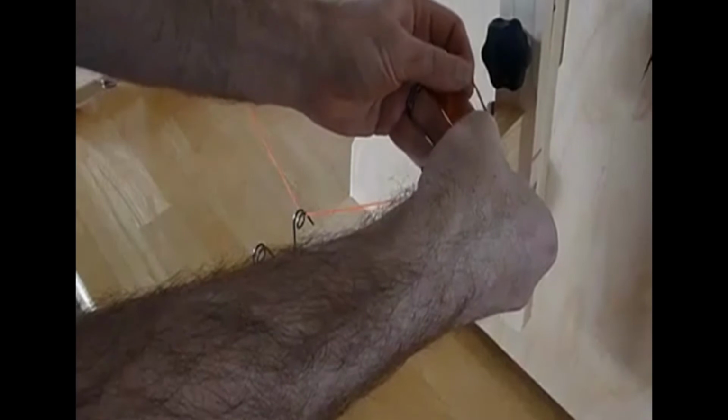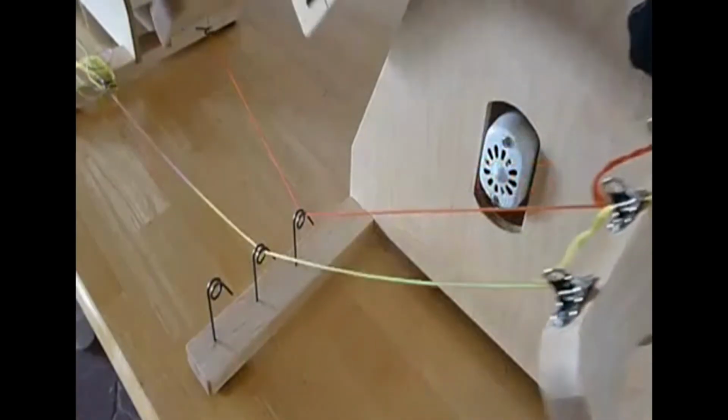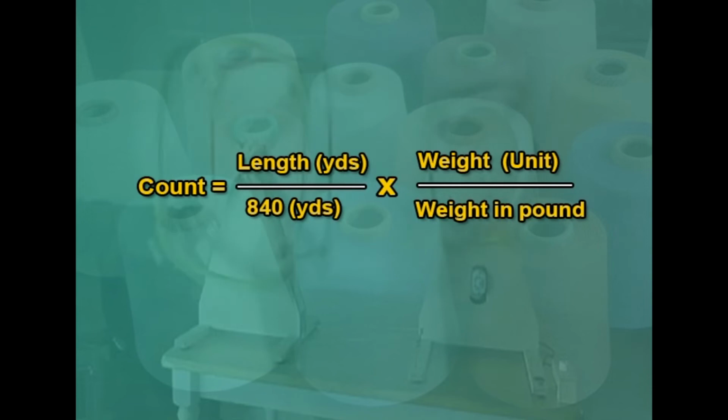And here the first step is that a lee is prepared by winding it around the circumference, and then the lee is taken and analyzed in an analytical balance with 0.1 milligram accuracy, and then the weight is converted into pounds. So, from that we can derive the count using the formula which has already been discussed.